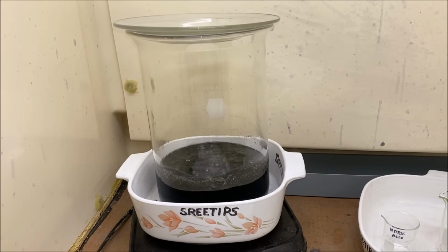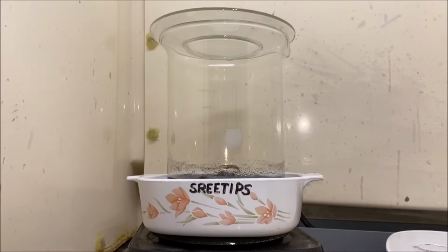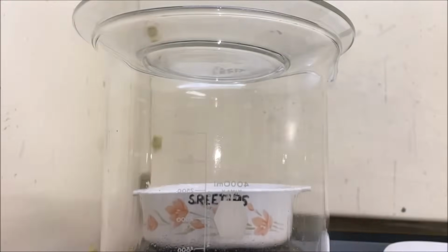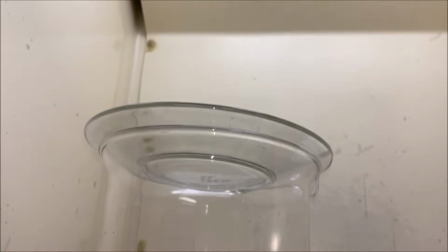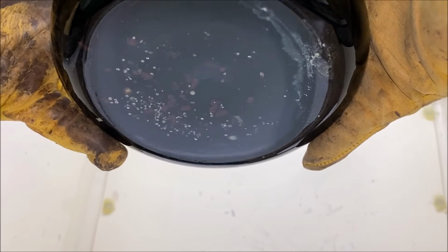I've been adding nitric acid to this. It's been on boiling now for a good 6, maybe 8 hours or so. I'm gonna get under here and let's see if we can look and see what we've got underneath. Just check it out here. See what's left on the bottom. There's a few solids, but not much.